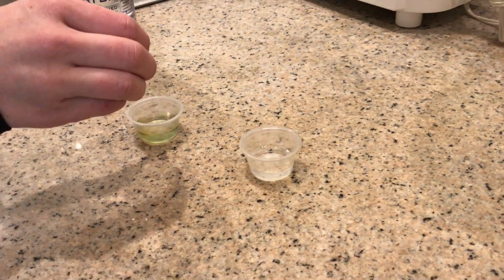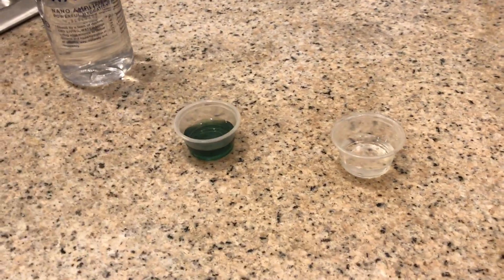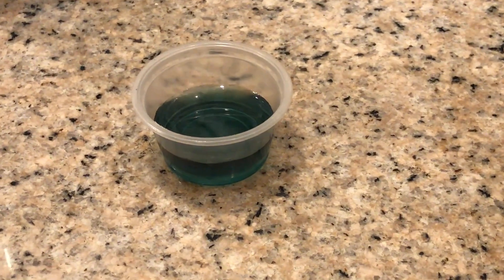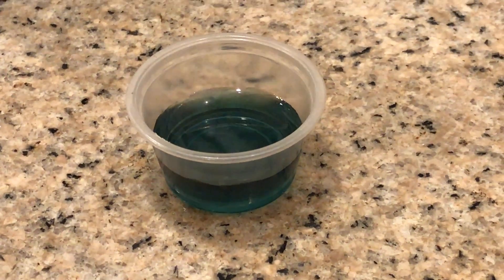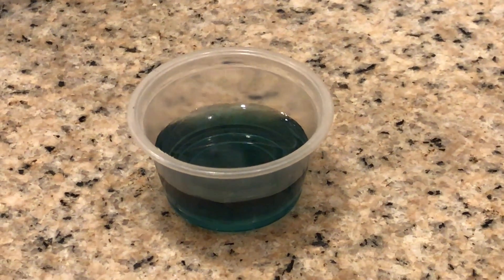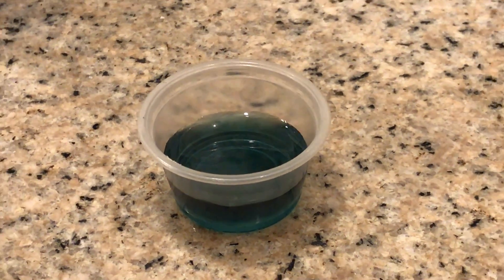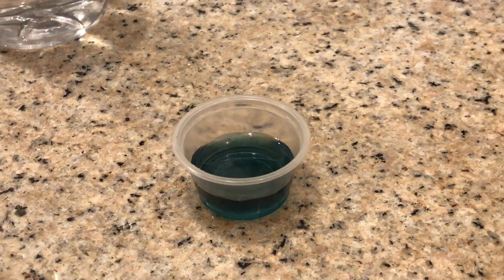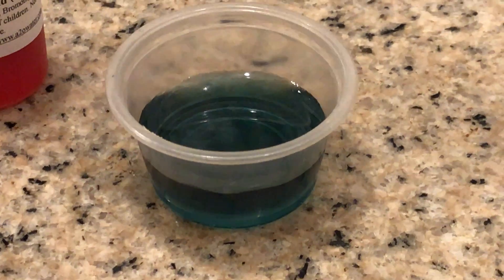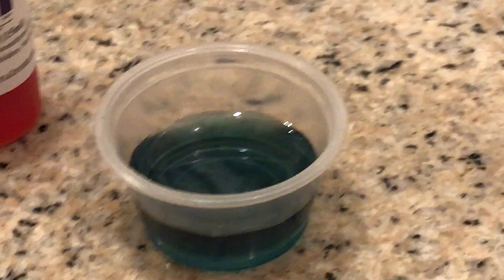We've already put the required quantity of water. So we've already put the drops that the manufacturer requires us to put — about 2 to 3 of them — and about 10 cc's of water sample, and this is what we've gotten.